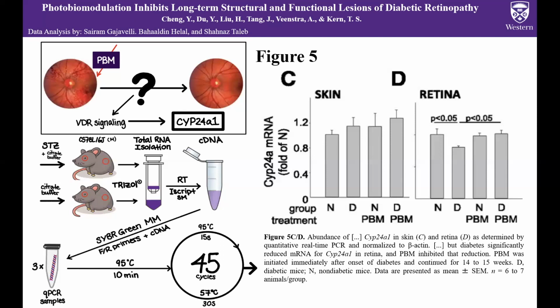Overall, the qPCR methodology was described in considerable detail and the results were presented in a clear format. However, the study did not explain why CYP24A1 was selected and its results were not adequately interpreted. This disparity allows the readers to understand what exactly was done and what the results were, but it does not provide the readers with enough information to understand the full relevance or implications of conducting qPCR on CYP24A1.